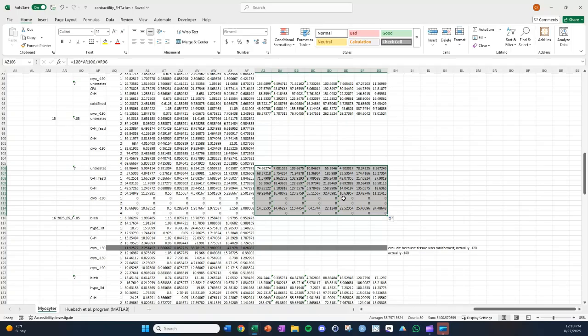And this really allows, as mentioned before, I like to, especially for the contraction relaxation speed, always normalize to the initial value. I think it's meaningful to report, say, the beats per minute on their own, or the time between the contraction and relaxation on their own, 0.3 seconds here, whatever that is. But these contraction speed and relaxation speeds, I think, are best reported in terms of some sort of normalization, because saying 6.3 arbitrary units per second isn't really meaningful.